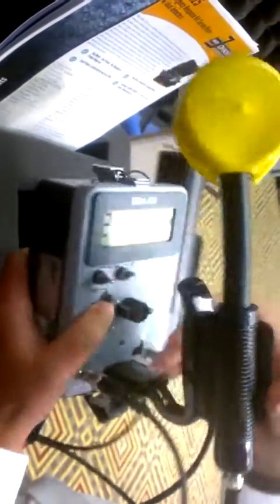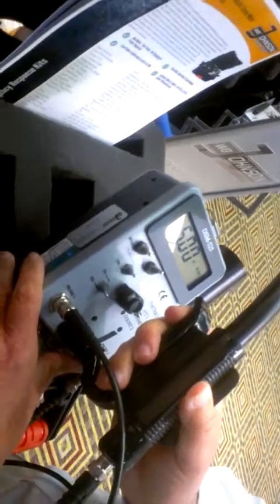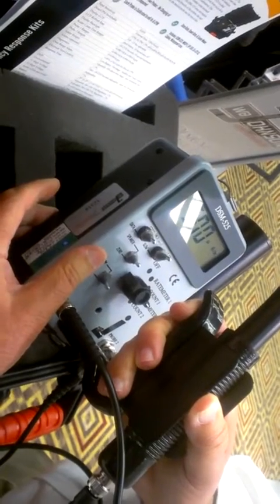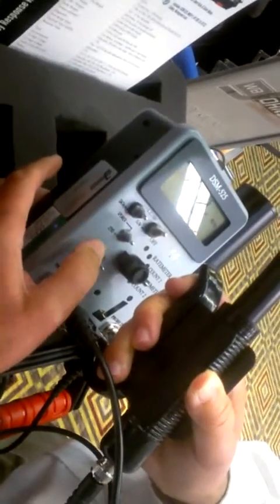One of the main features of all our instruments is this counts per minute dose switch. Just by toggling this, you can go between counts per minute or dose. Both modes are calibrated, which is unique to our instruments — most manufacturers cannot calibrate both modes, they can only calibrate one.